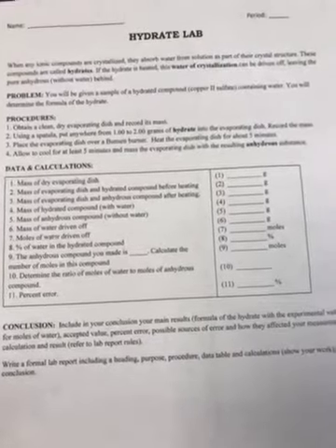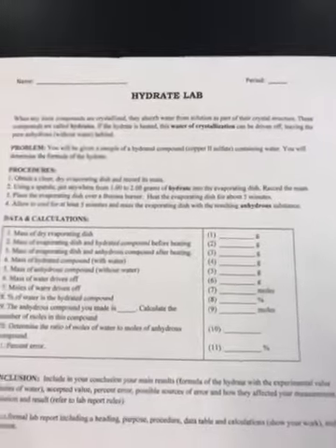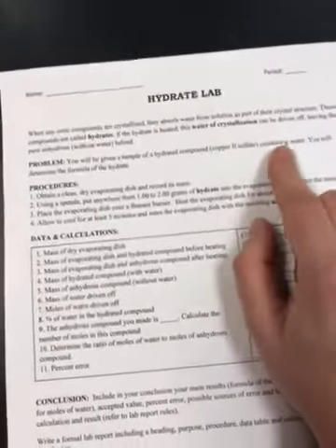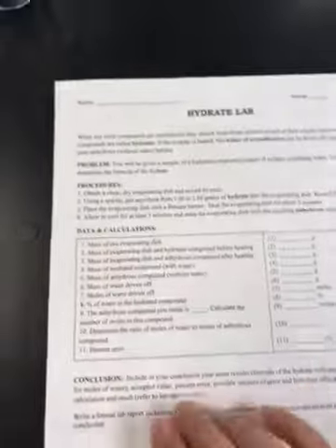Hi guys, today we're going to do the Hydrate Lab together. So the purpose of this Hydrate Lab is that we are going to be given a hydrate, which is copper 2 sulfate, and it contains water. And our job is to find the formula of that hydrate.